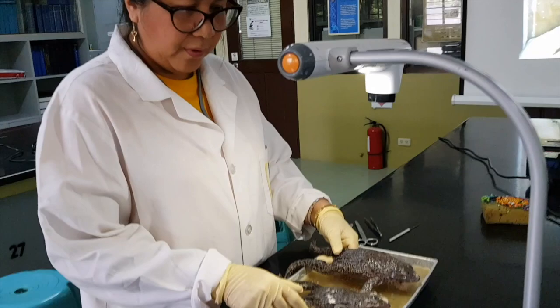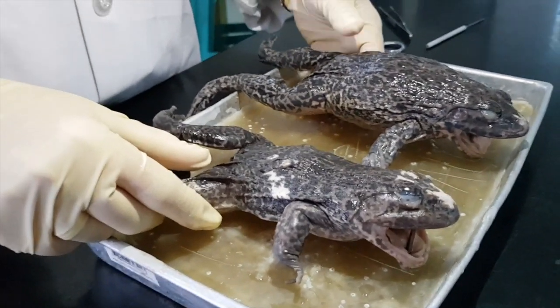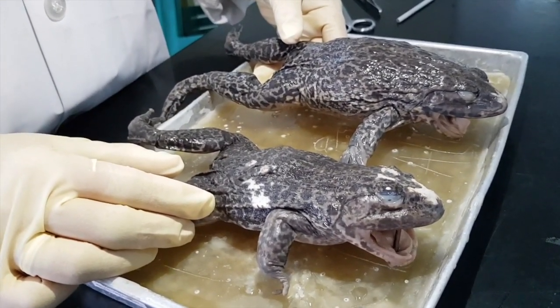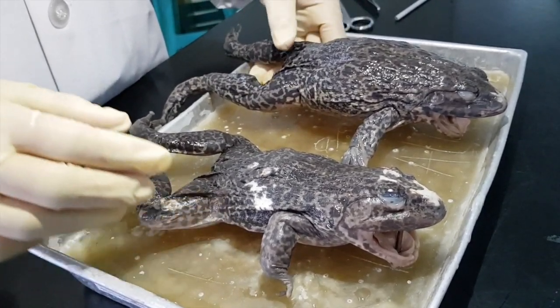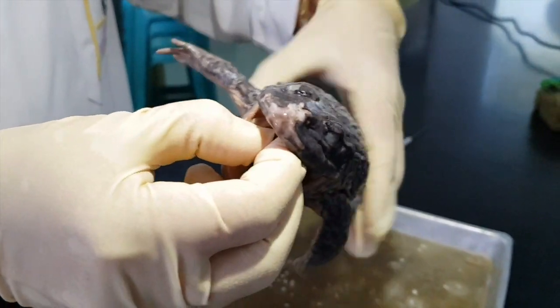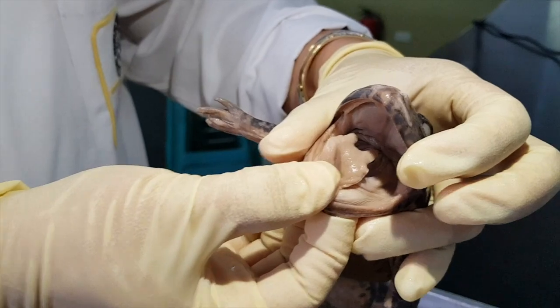Our specimen for dissection and representative for class Amphibia. The species is an introduced frog in the Philippines. Its scientific name is Hoplobatrachus rugulosus, or in some, Hoplobatrachus chinensis. If you're going to look at the anatomy of the frog, let's first remove the stick. It is used to make the mouth of the frog open so we can see some of the structures.